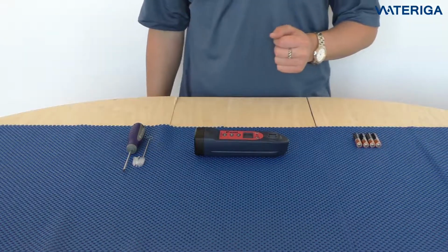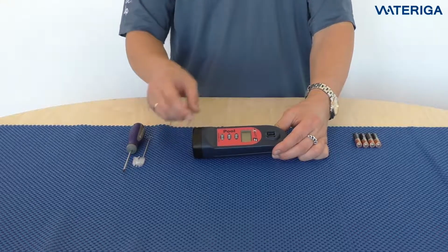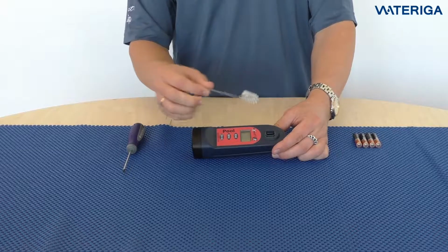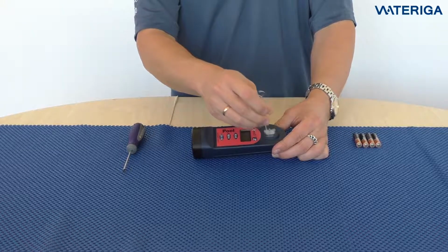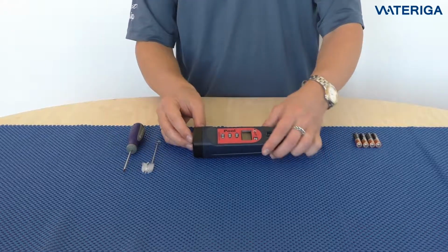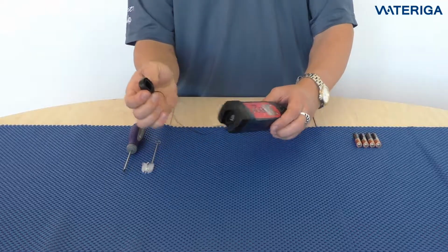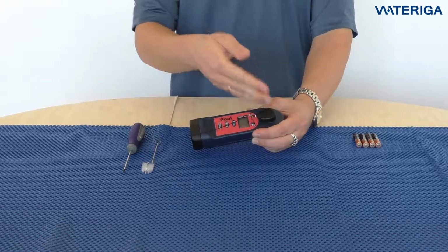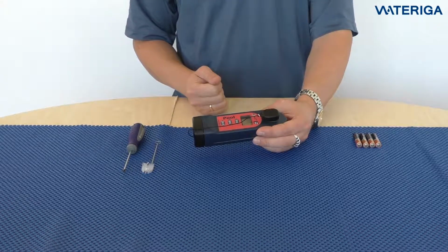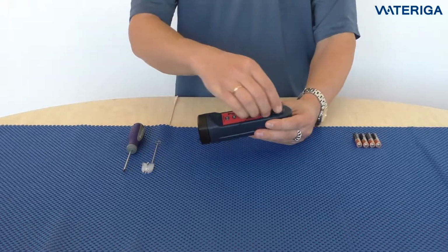The Pool eXact Easy photometer has a plastic built-in cell that cannot be taken out, and you can't lose it. We use a brush to clean the cell like this. We recommend using the brush before and after each test session. At the bottom of the meter you have a cap that you can use to stop the light from interfering when zeroing and reading the result. You can also use this cap for mixing the cyanuric acid reagents.